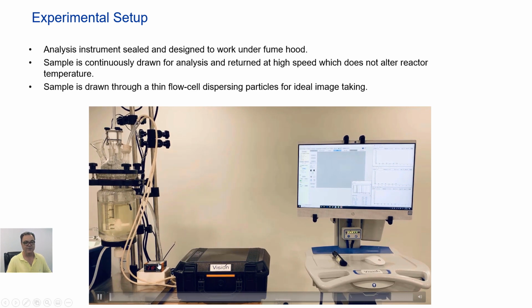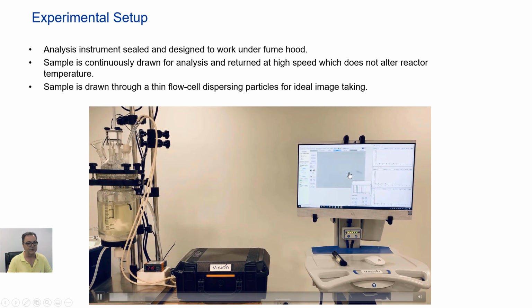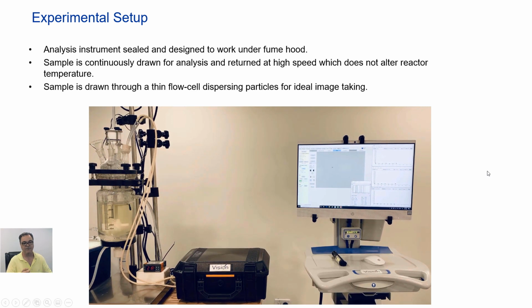Often these reactors are going to be sitting in fume hoods, so having real estate for equipment is very challenging. So having everything in a small package is very ideal. And then all the computational work is done with a battery backed up cart where the sample is viewed on the screen, and it's all real time.